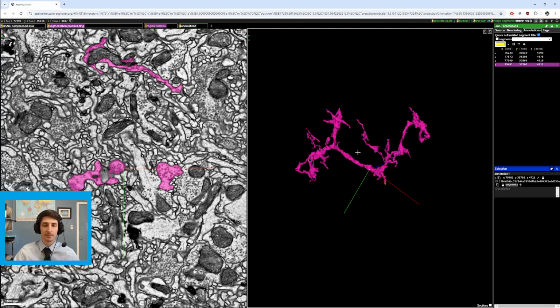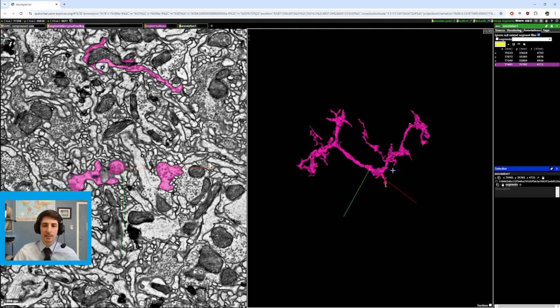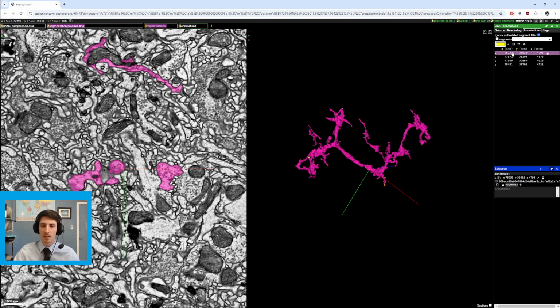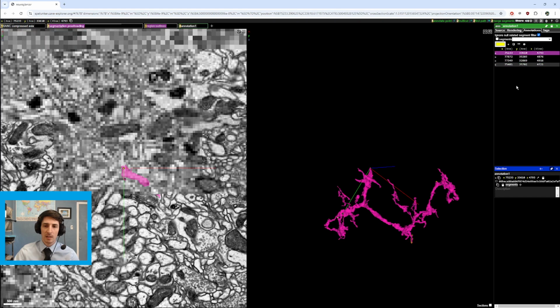So the first thing that sticks out to me is this part here. This part sticks out because this is a right angle. As you see, we have another right angle here. This is not exactly a right angle, but this sort of angle here. We have this angle here, and this end is suspicious as well. I put little points on each one, so we could go through those with the brackets.